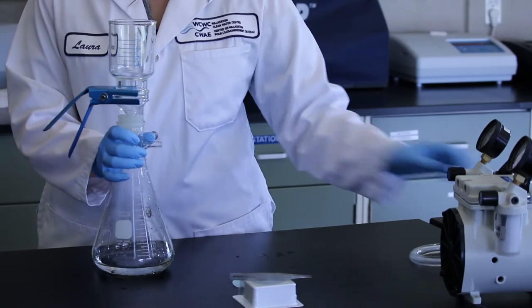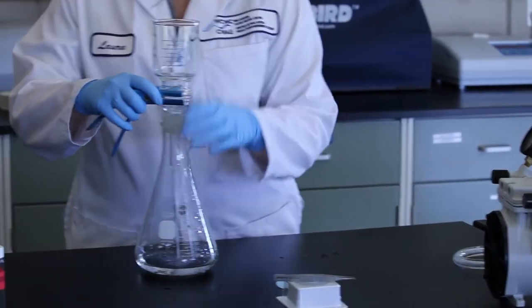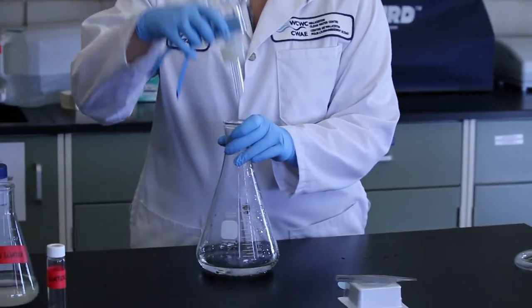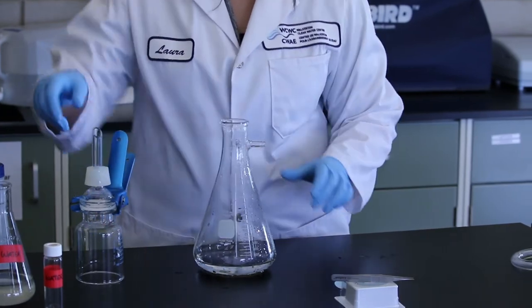By filtering the sample, the particulate organic carbon is removed, and the analyzer will only measure dissolved organic carbon.